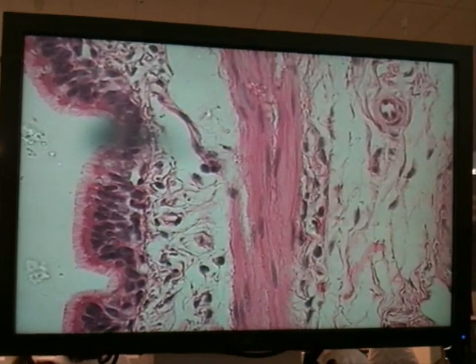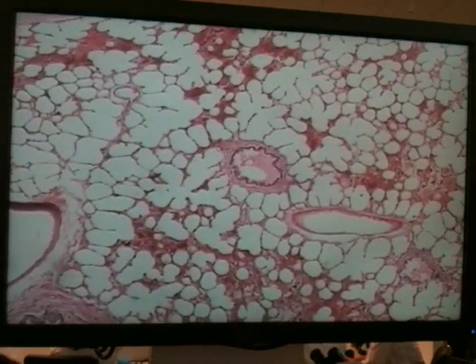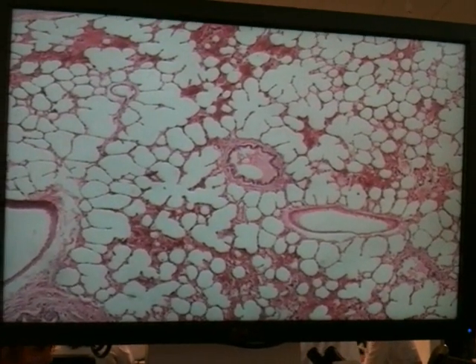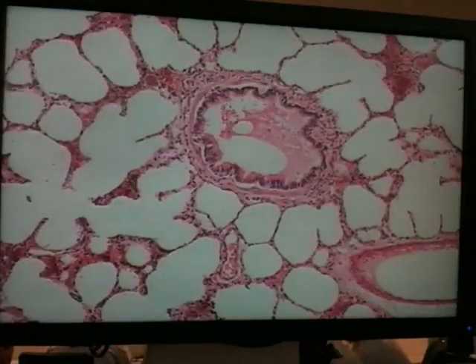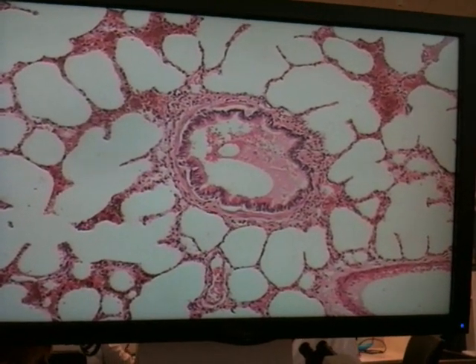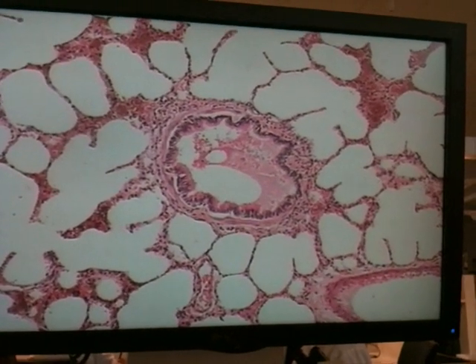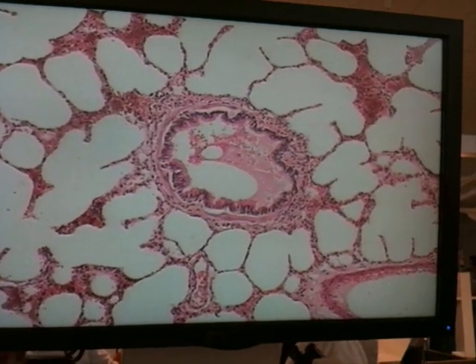We'll have a look at the bronchioles as well. That structure in the middle of the screen looks like a bronchiole. Bronchioles can be distinguished from the bronchi because there's no cartilage around them, but you should still be able to see a circle of smooth muscle. Even at medium power, we can see there's no evidence of any cartilage around it, but we can see a fairly prominent regular muscle layer.